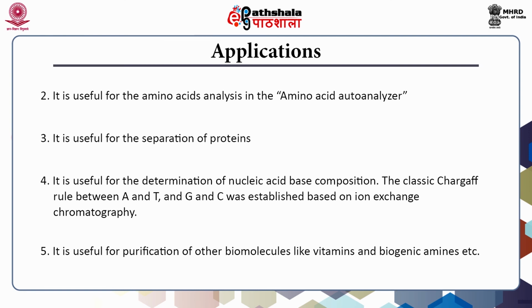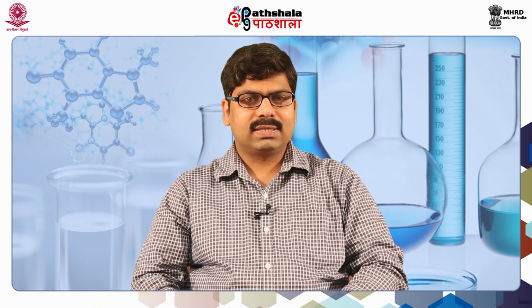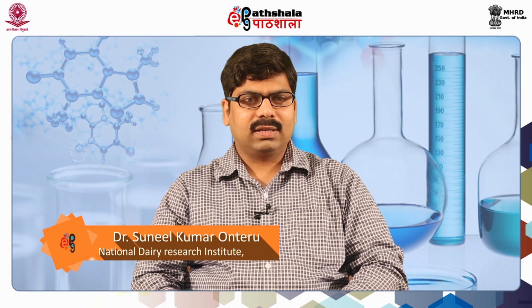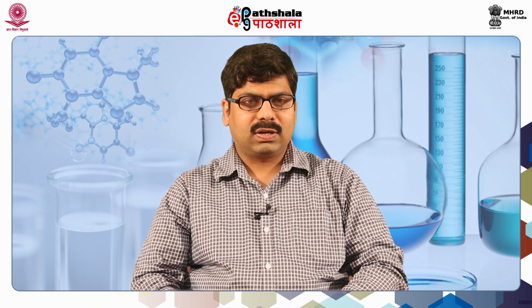These are the main applications which we have discussed in this lecture, but there are many applications for ion exchange chromatography in several industries. Overall, in this lecture, we discussed the basic concept and principle of ion exchange chromatography, types of ion exchangers, choice of ion exchangers, the procedure of ion exchange chromatography, and the applications of ion exchange chromatography.